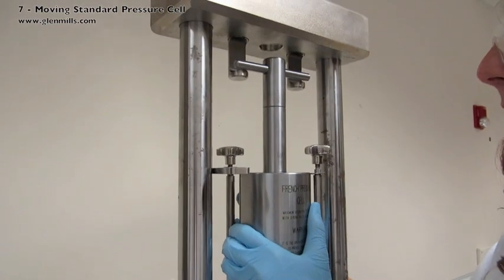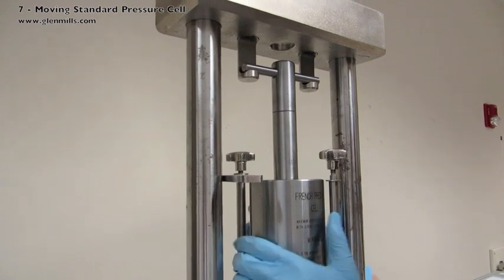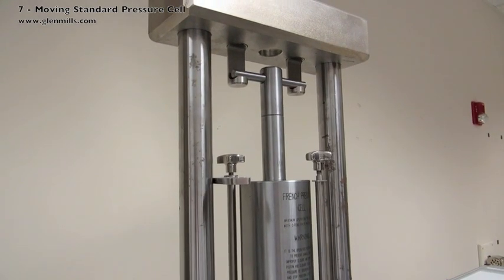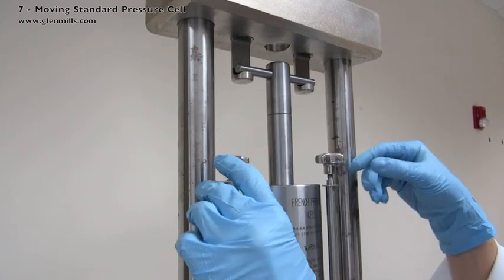Hook the piston's T-handle onto the J-hooks beneath the top platen. The top of the piston inserts into a recess hole in the top platen.